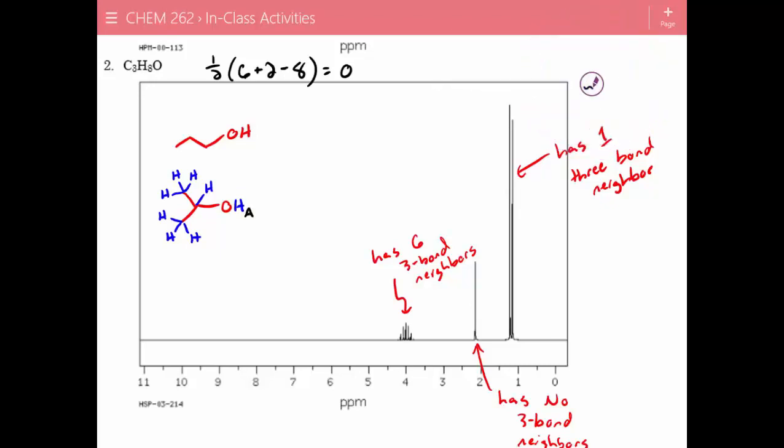We've got this HA proton on that alcohol. What about this one over here? It's its own, right? It's attached to a carbon that's attached to an alcohol that's attached to 2 methyl groups, so it's unique. What about these other methyl groups? So these are all going to be the same, these HCs. Is the other methyl group the same or different? Same, exactly. All right, so now if we look at HC, how many 3-bond neighbors are there? There's 1 3-bond neighbor, which means it should be split into what? A doublet, exactly. So we can immediately say, well, maybe this doublet over here corresponds to HC.